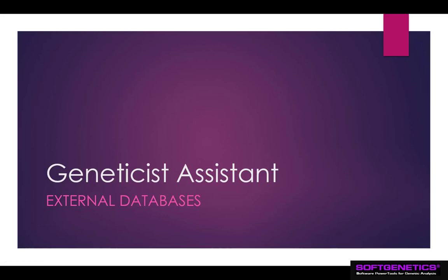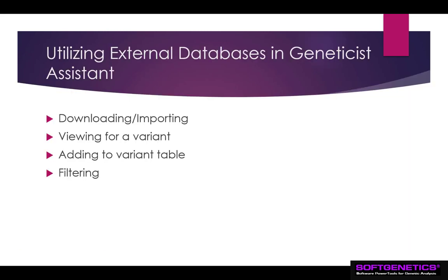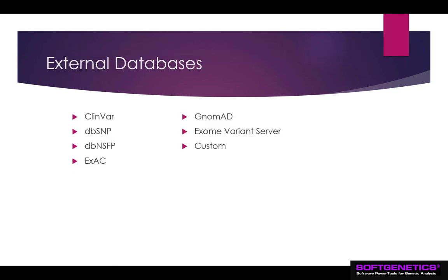We'll be discussing how you can download and utilize external databases such as ClinVar, ExAC, gnomAD, and others with Geneticist Assistant. In this webinar, we'll discuss downloading and importing databases, reviewing database information for an individual variant, adding database fields to the variant table for samples, and filtering variants based on the database fields.